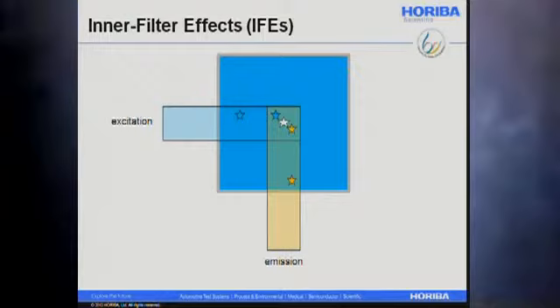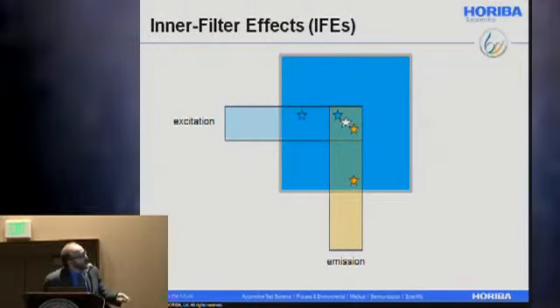And again, the key thing is to correct for the absorption of the sample, because fluorescence as a technique is really evaluated where the excitation beam path and the emission beam path overlap. As sample concentration changes, if the concentration gets too high there's a probability that a molecule will absorb a photon before it gets to the area where the fluorescence can be measured, and basically that reduces the intensity of the spectrum.